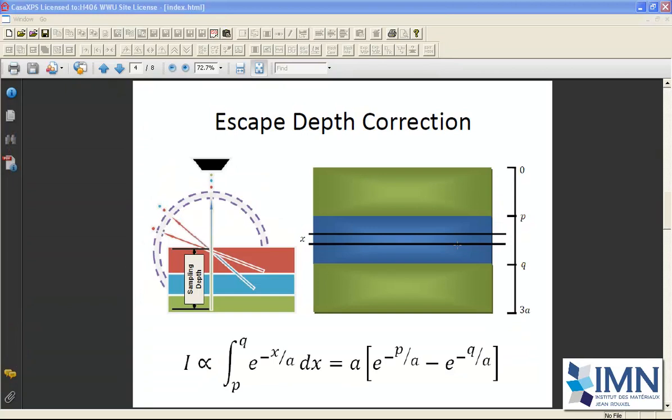The intensity of the oxygen 1s signal will be influenced by the sample itself. What happens when an electron is ejected from an oxygen atom within the sample is that the electron must traverse the sample before entering the vacuum, and on route it may be inelastically scattered, meaning that energy is lost, and therefore the electron that originally started out with the energy of an oxygen 1s electron emerges into the vacuum and is recorded by the analyzer at a different energy. And actually this is a source for the background in the XPS data.